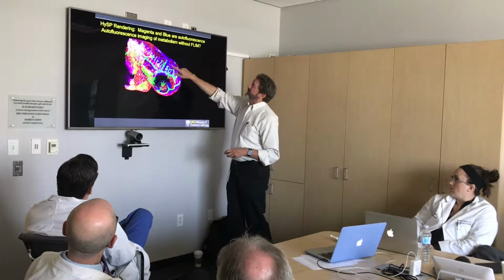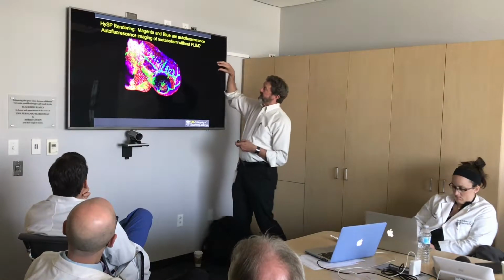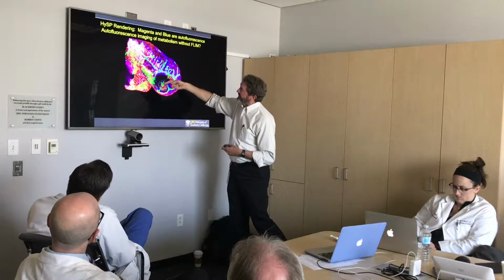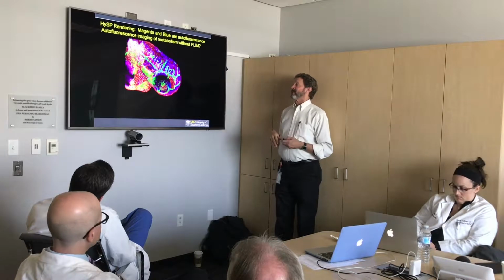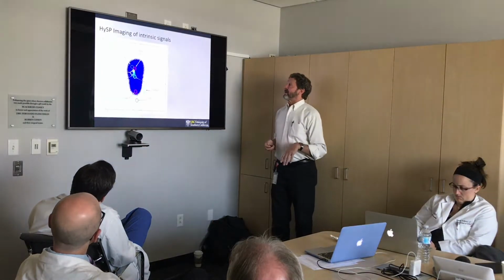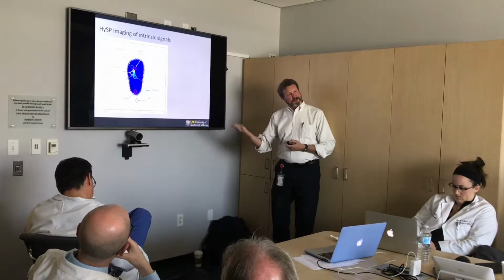And this is a structural fluorescence, not unlike the green fluorescence you get out of lung tissue and things of that sort. But you can see that we can look right through the autofluorescent retinal pigment epithelium of the eye and see the blood vessels inside. You can see the lumen and the soma of the vascular endothelial cells on the two sides. So that means we can start to see these things in autofluorescence. Sorry, I should say, we can see things that are exogenous labels.